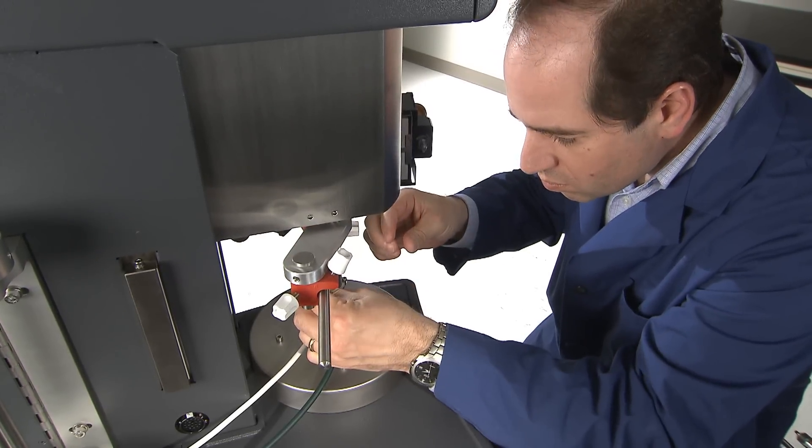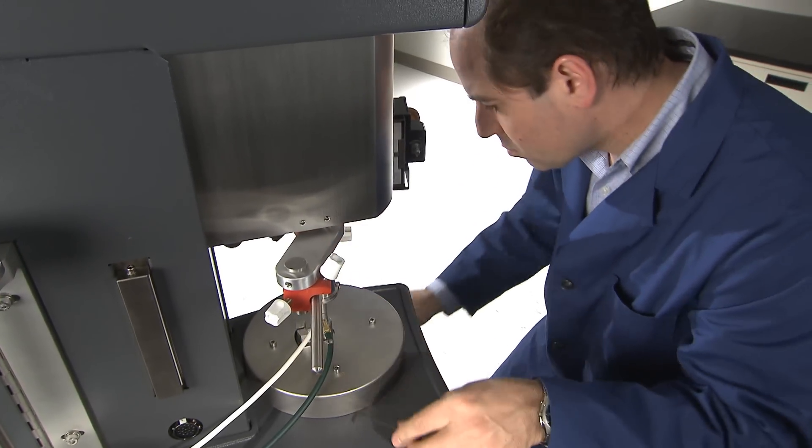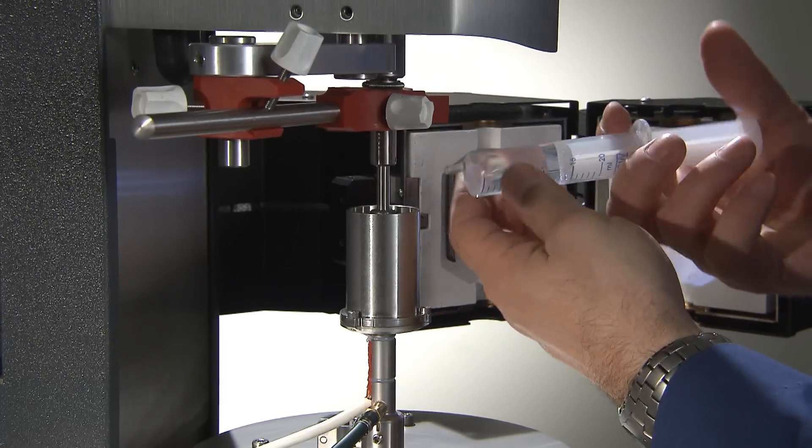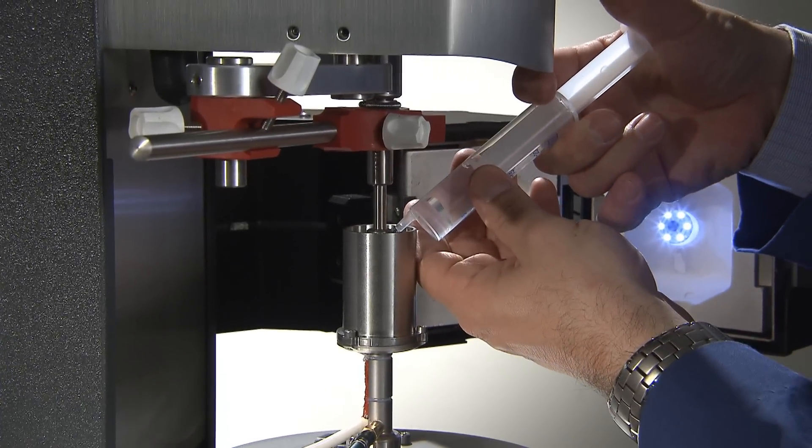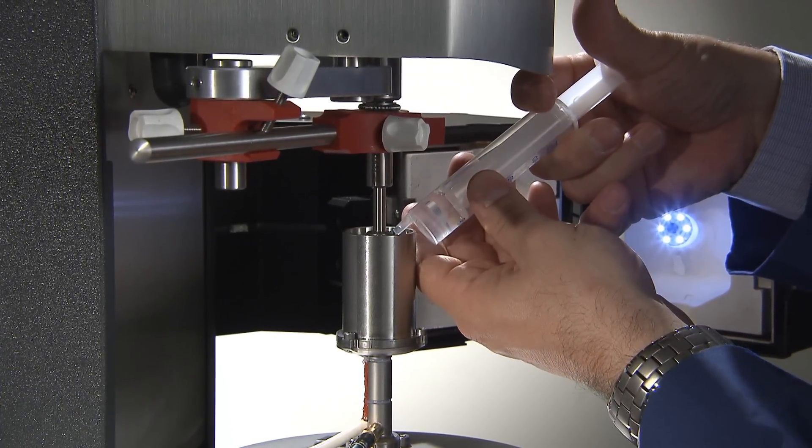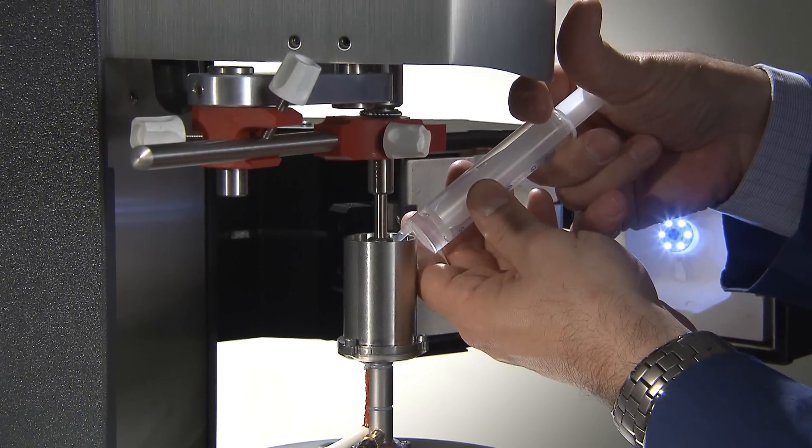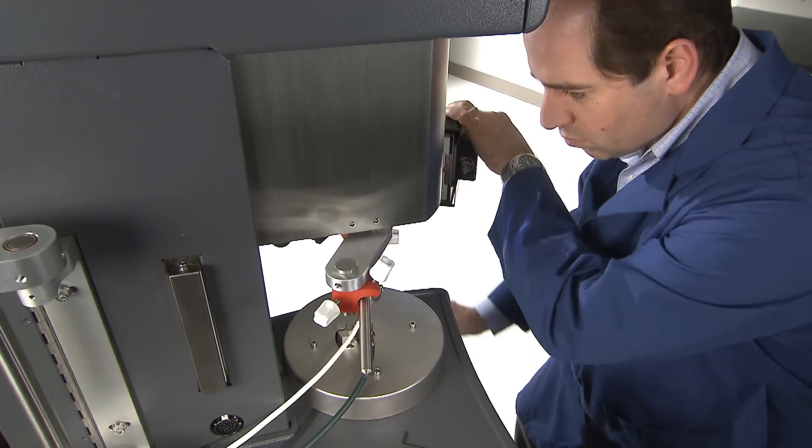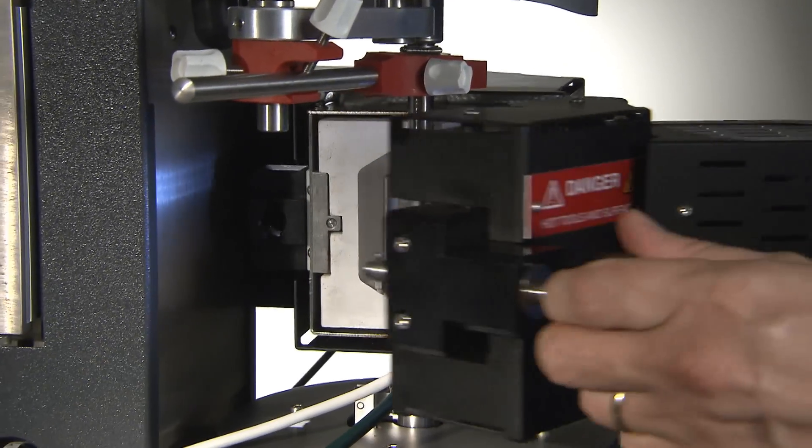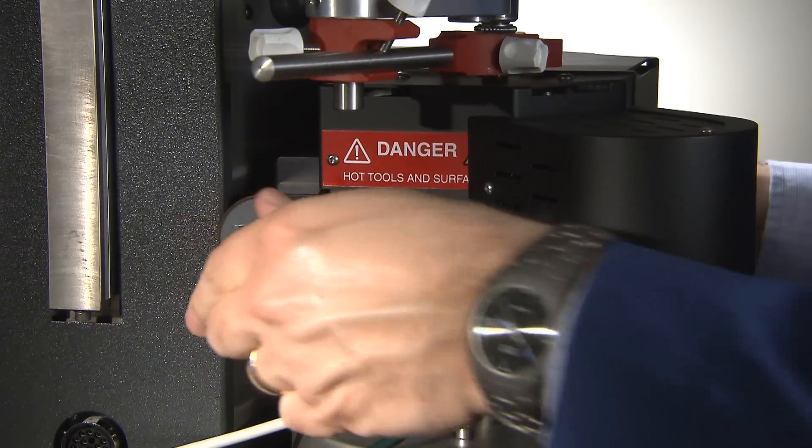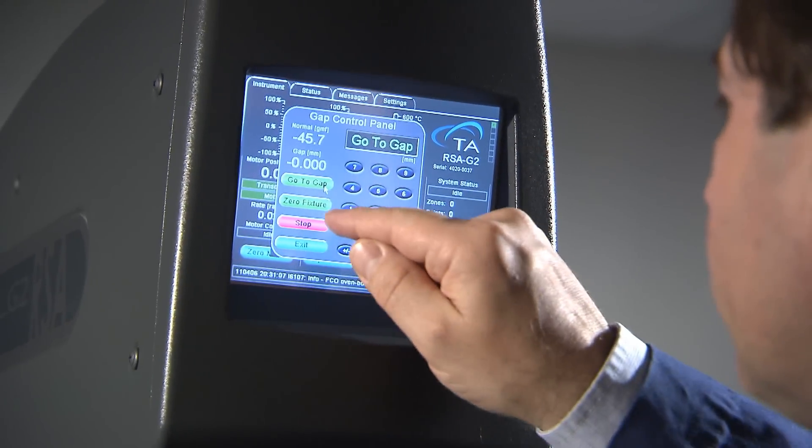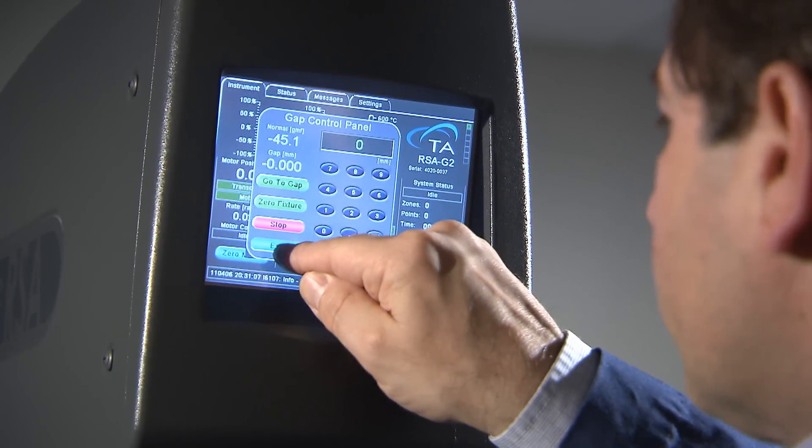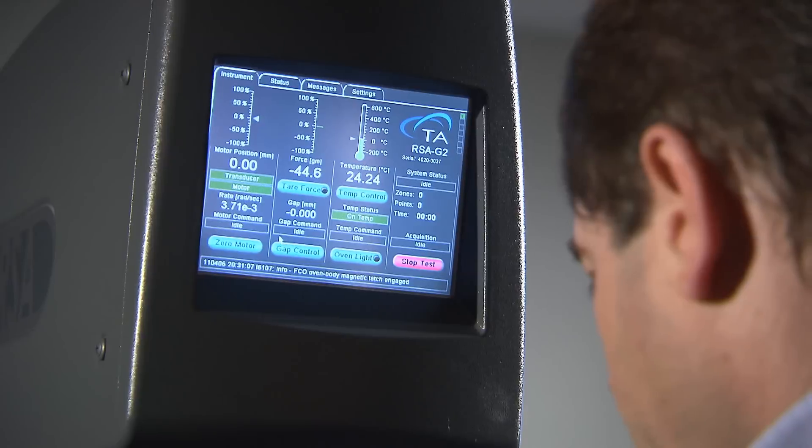The RSA-G2 offers a new level of convenience in immersion testing. The fixture takes advantage of the standard FCO over a range of minus 10 to 200 degrees Celsius and has a convenient removable container and fill and drain port, so there is no need for separate environmental controls or inverting instrument components. The system also includes tension, compression, and three-point bending clamps.